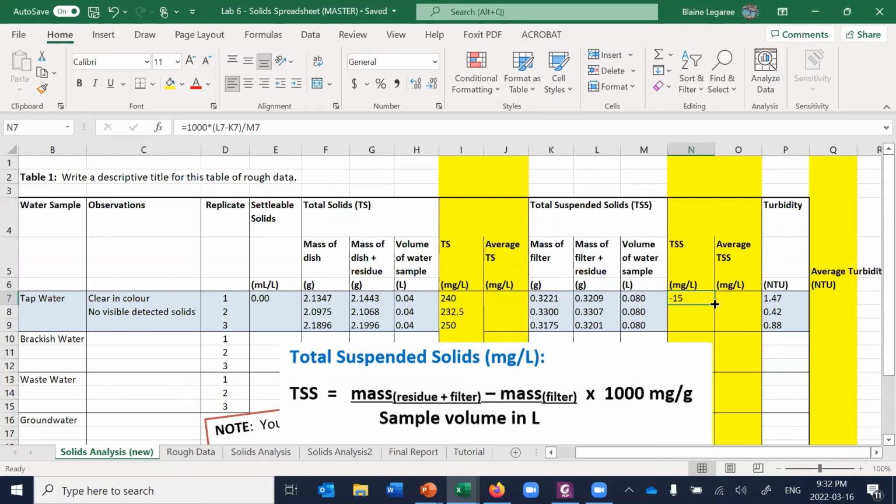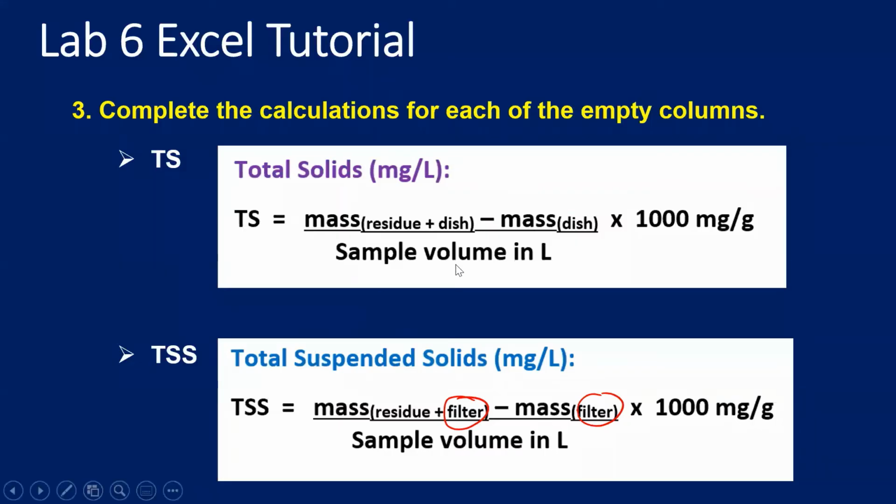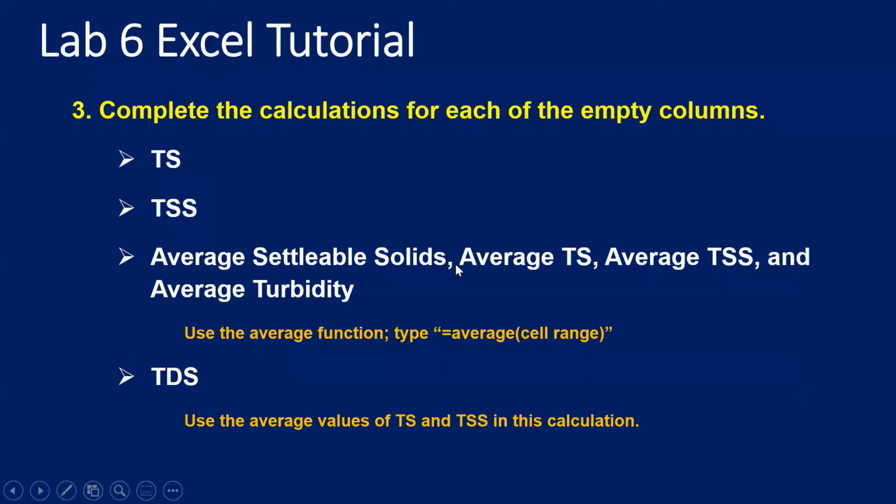So eventually we're going to change that to 0, but I'm going to copy this formula down here like that. So this gives me my calculations for my total solids and my total suspended solids. And that is all ready to go.